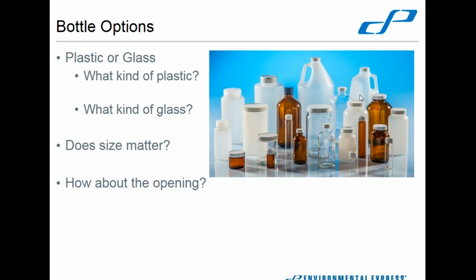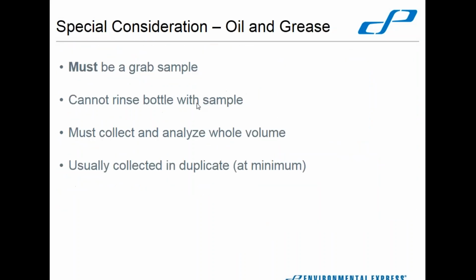show you what I'm looking at here. This type, here, let me minimize my screen out of the way. This type of container here with this really narrow opening, I usually saw them collected in glass or plastic, but something with a really narrow opening like this one is what I've typically seen. I don't know if that was actually required or if that's just what my lab ended up doing. So that would be something that I think you can find in the state sample guidance.